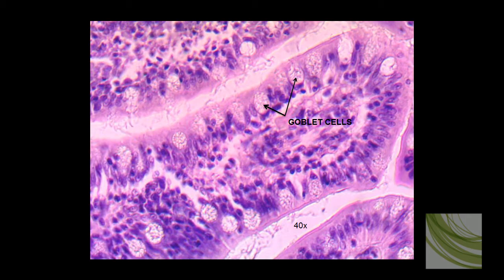Now here I'm using the 40X objective, and we can see a lot of detail here. Now what we want to primarily look at, we're going to look at these simple columnar cells. We'll see the nuclei, and these are goblet cells.